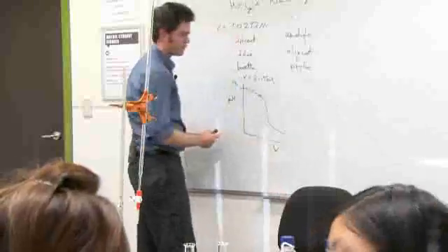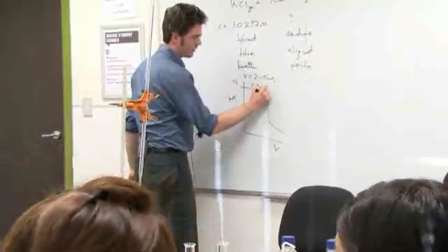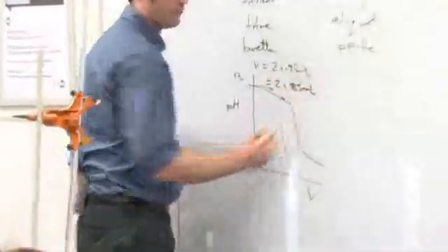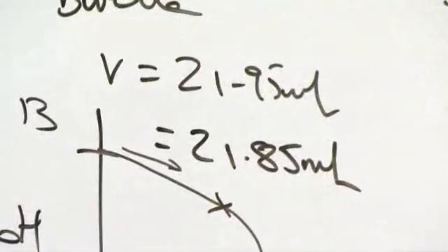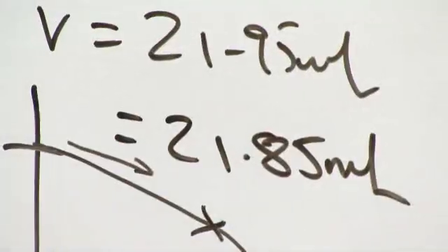So two drops removed from that. So the real answer was actually 21.85 mils. And that was a rough titration. We need to do that again. But using this data, let's do the calculation.